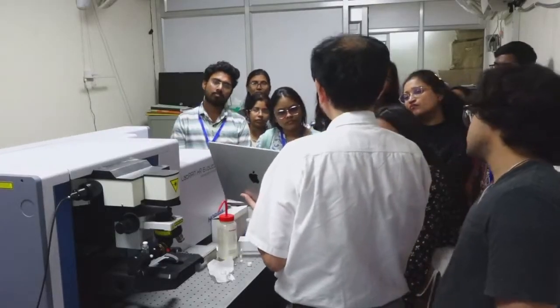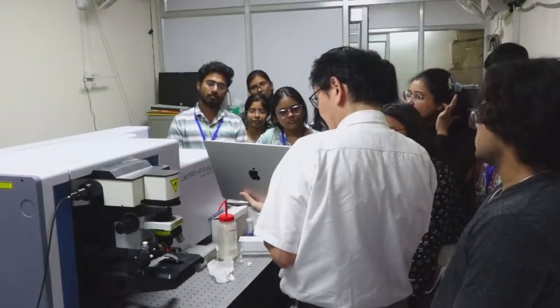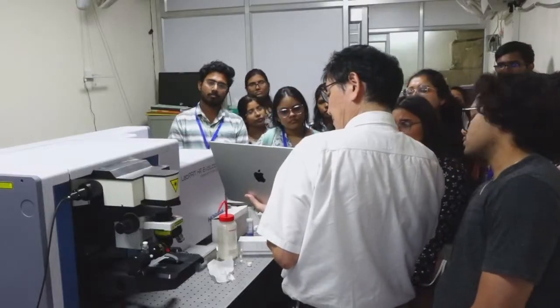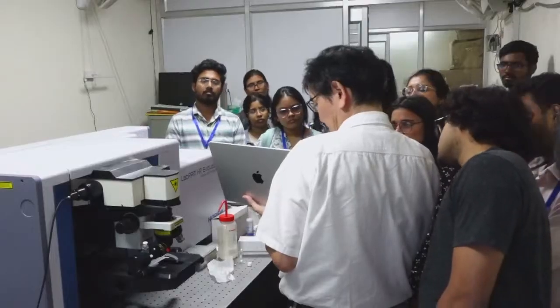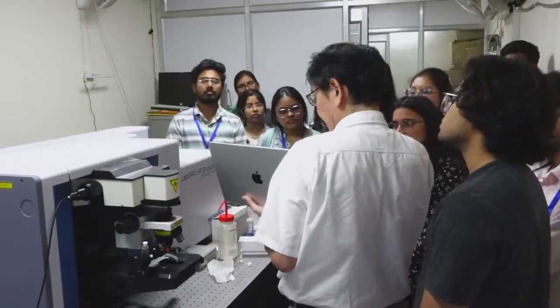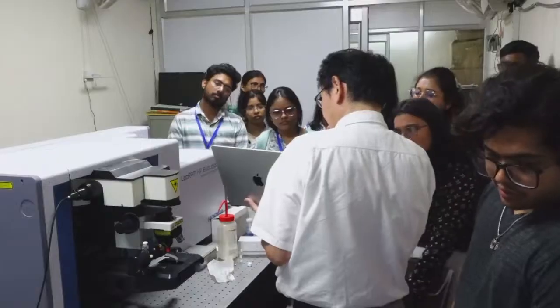If possible, please measure both and consider the peak assignment. And just a moment, I change the spectral region. Okay, it may be clearer.